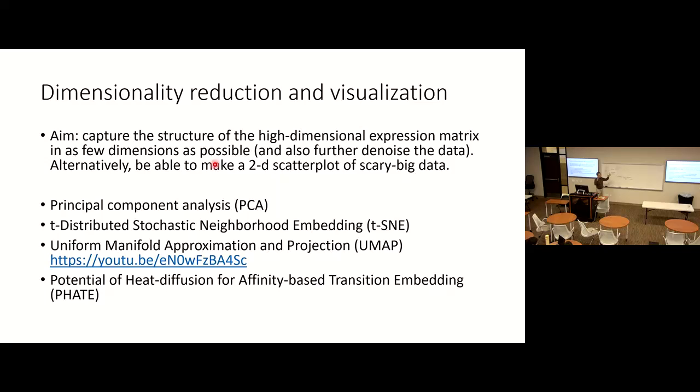So PCA allows you to rotate your data and then project your data to the new coordinate system and then measure the distance between data points using the new coordinate system. Let's see the rotation. So let's see, we have one data point.